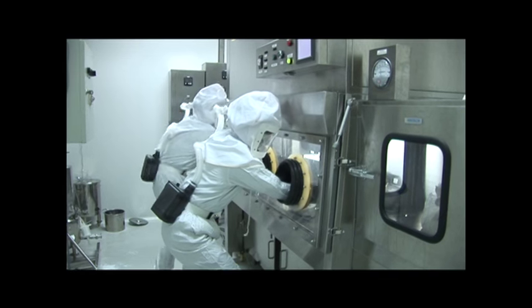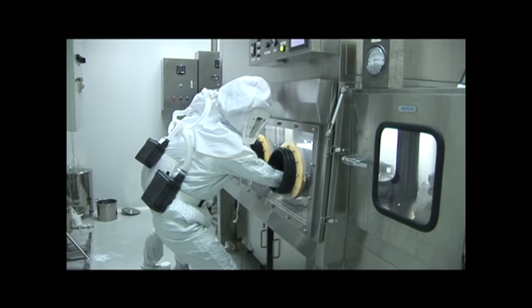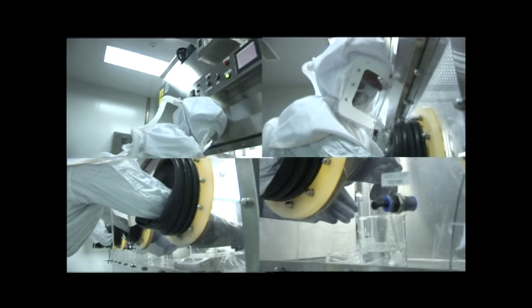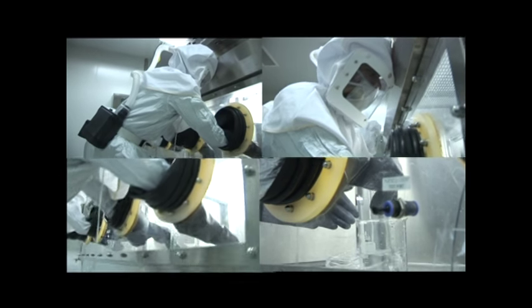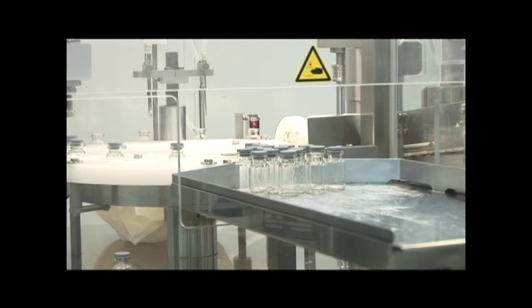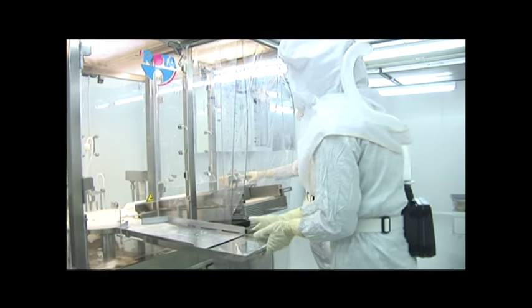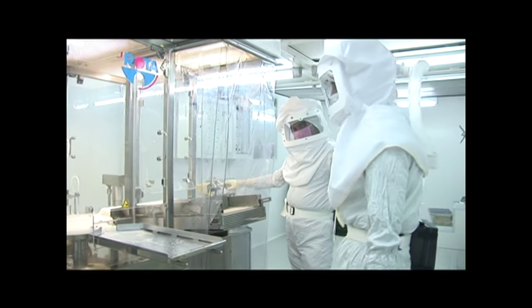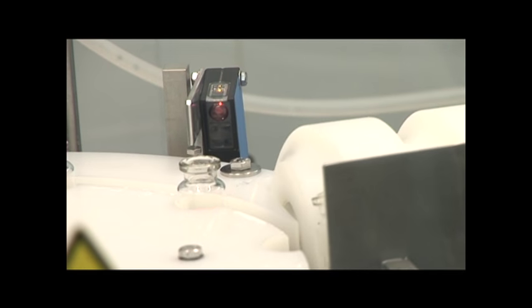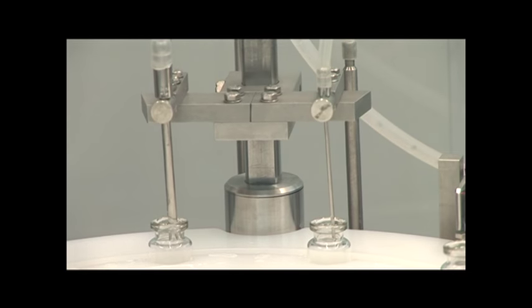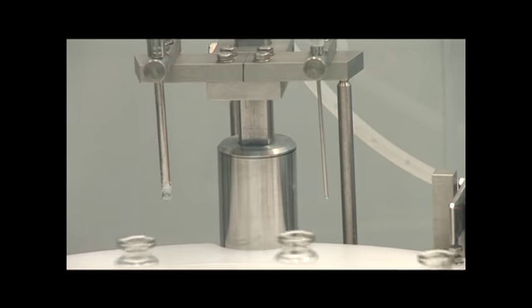To ensure people's safety, the entry to the oncology plant is highly restricted and controlled with stringent precautionary measures like change room with one-way entry and separate exit with water shower, space suit with oxygen mask to prevent personnel from contamination of cytotoxic drugs.